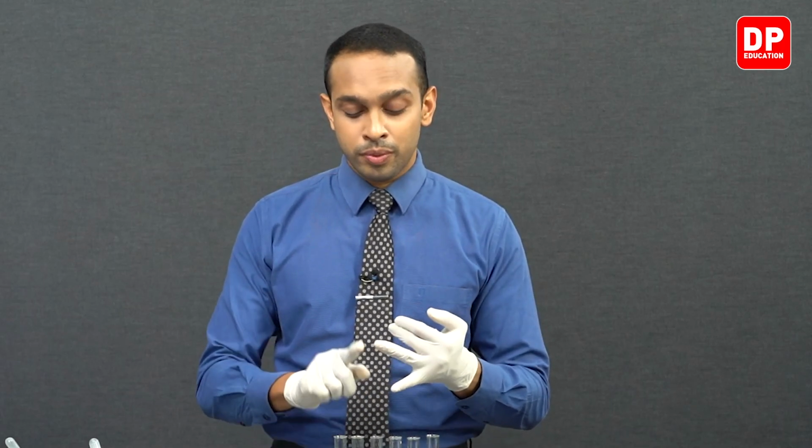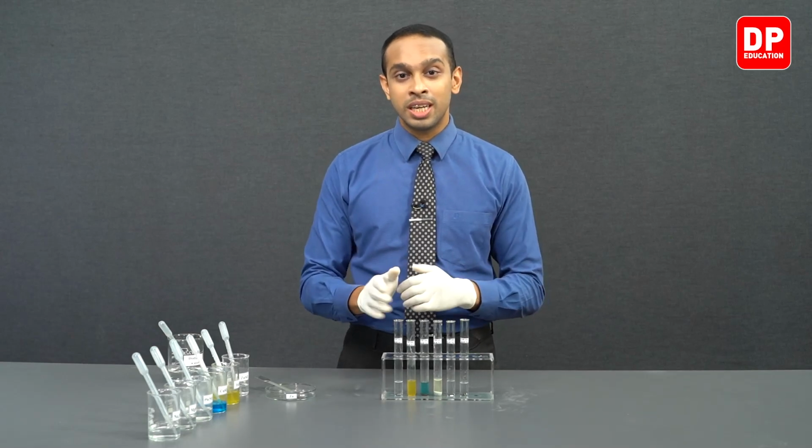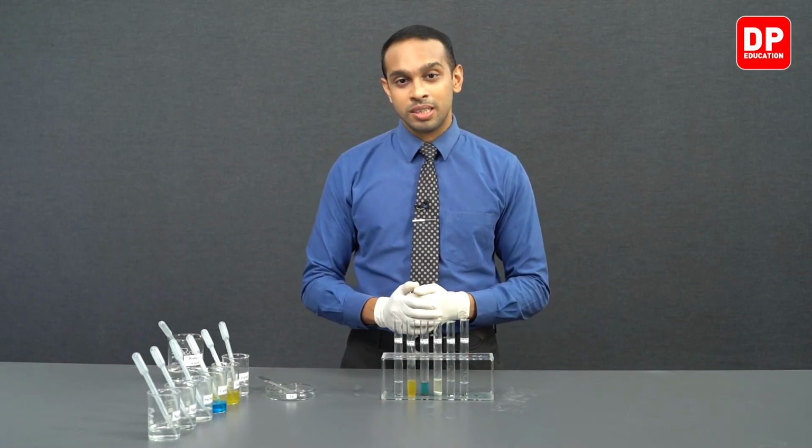If you observe magnesium, magnesium reacted with the most amount of solutions over here, but magnesium couldn't displace sodium 1 plus ions as sodium, that is why magnesium is less reactive than sodium. But magnesium was more reactive than all of the other solutions. Magnesium was able to displace copper, lead, iron, and zinc. So out of the solutions that we have over here, all of the solutions except for magnesium 2 plus itself and sodium 1 plus aqueous ions, magnesium was able to displace all of the other metals. So magnesium is the second most reactive element we saw in this experiment.